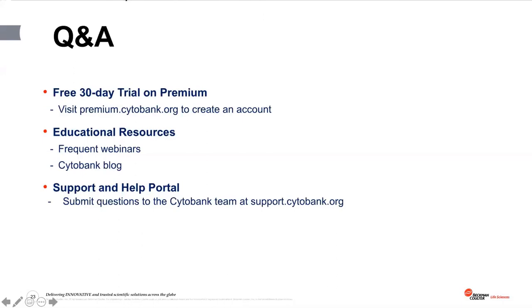Perfect, thank you, Jihao. Another question: is Drop available to download on my computer? I'm going to get Steph to answer this question. Hi, so Drop is part of the Cytobank platform that you can access by visiting the website and logging into your account. There's nothing that you can or should download in order to use it. Excellent, thank you very much.